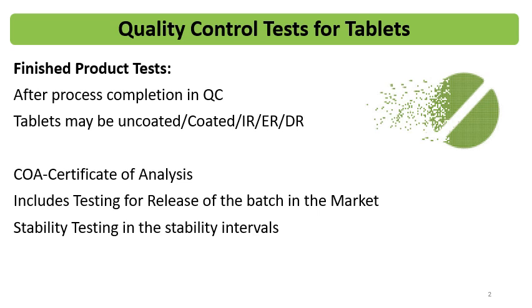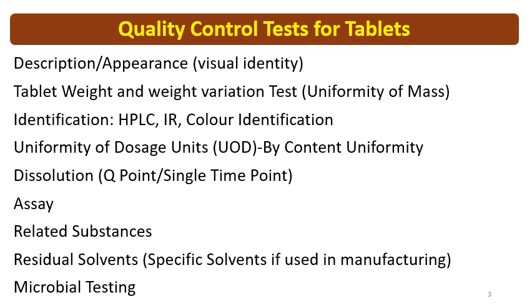Stability testing is also performed on formulations which are yet to be approved, like exhibit batches.